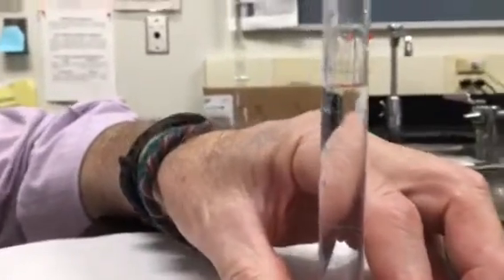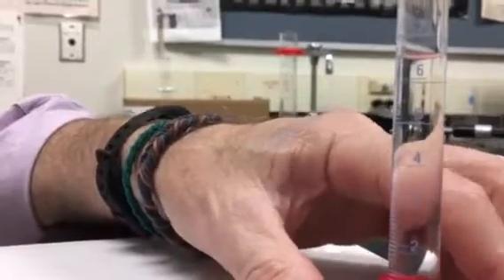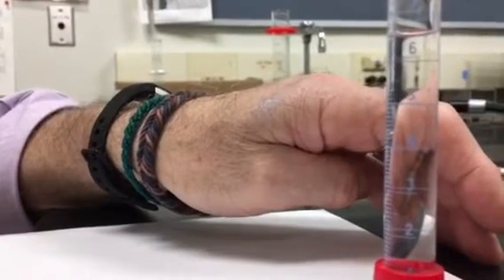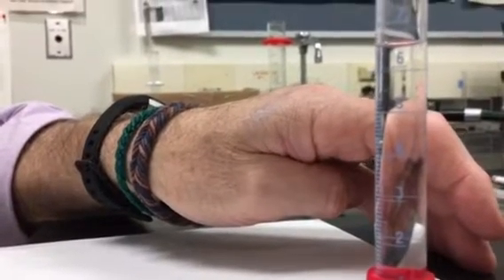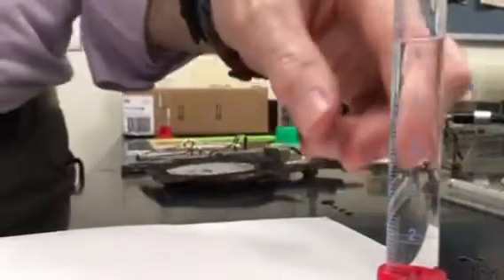Now following the same protocol, getting down to where I can see the meniscus, at eye level. With my old eyes, I'm going to ask Ms. Dulimer to tell me what that is, because I really can't say. What is it? You think it's 6.5? It looks like 6.50 to me. Make sure you go out to the hundredths place. That will be very important. So that number is 6.50.